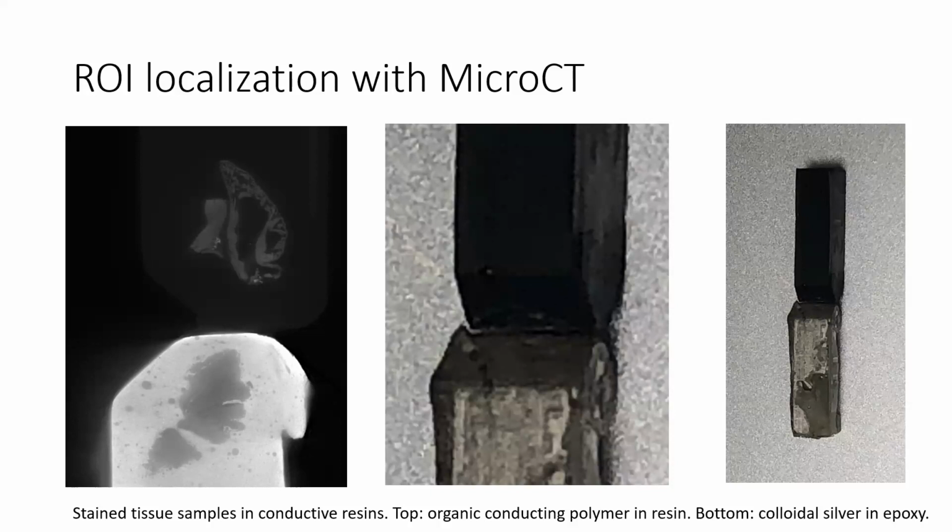And in the bottom sample, it's fine. You can effectively find where your sample is. You can't really see any features, which, when the block is opaque and you can't find your sample at all, is enough to hit your sample if you want to image it in EM. In the top, you can actually pick out which ROI you are interested in, trim the block down to that, and then image it in SEM or TEM. I'm really excited about that top block, actually. There's more work to be done on that.